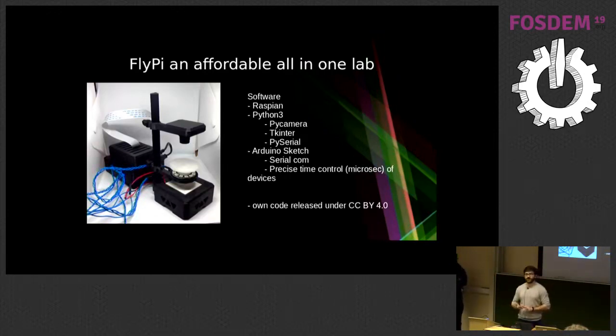Not very hard. So the question was, how hard it was to get focused on the micrometer range. So it wasn't very hard. As soon as we found the proper M12 lens, and I think this one has like a 6 millimeter working distance characteristic, we just needed a stable 3D printed surface where we could slowly move the thread of the camera and the object.